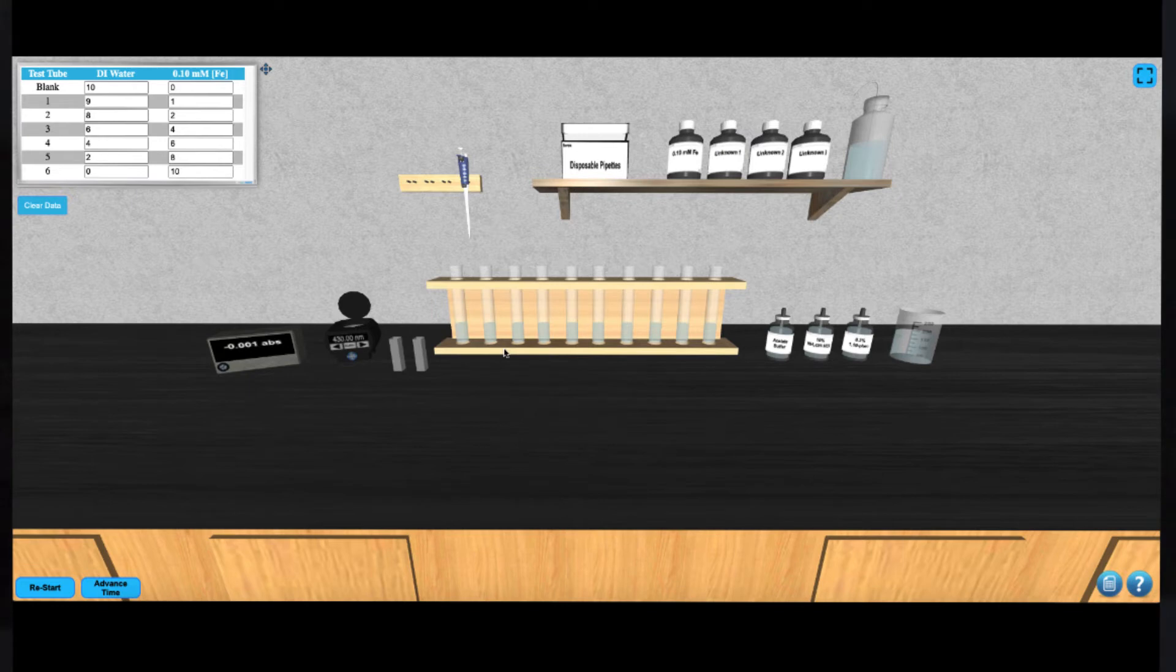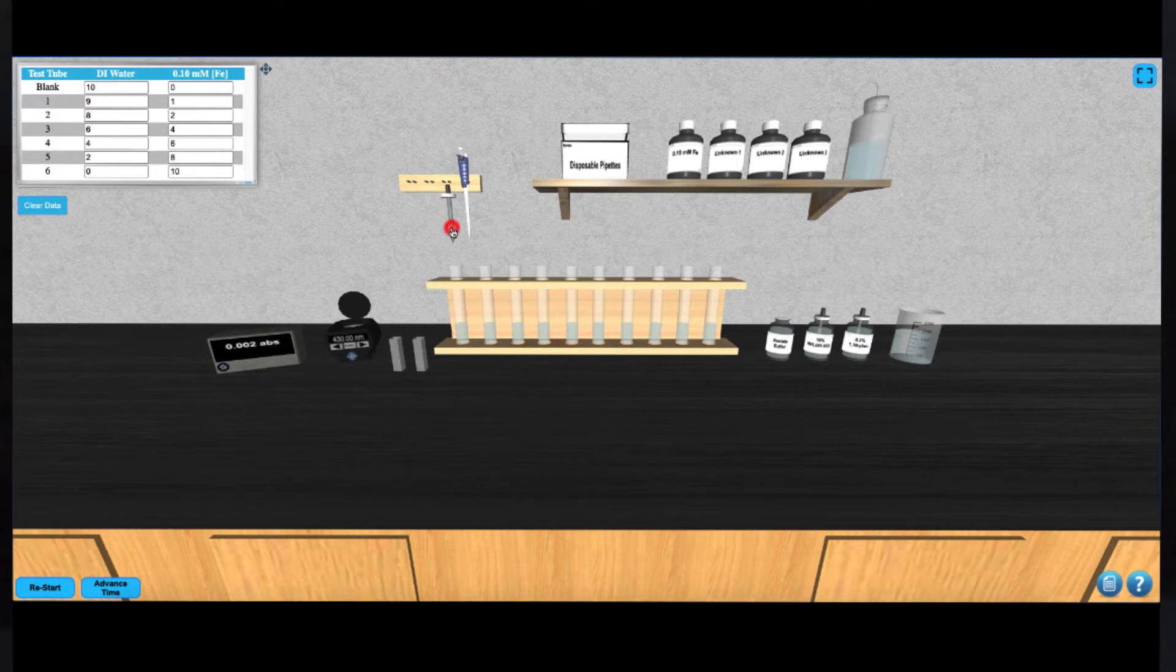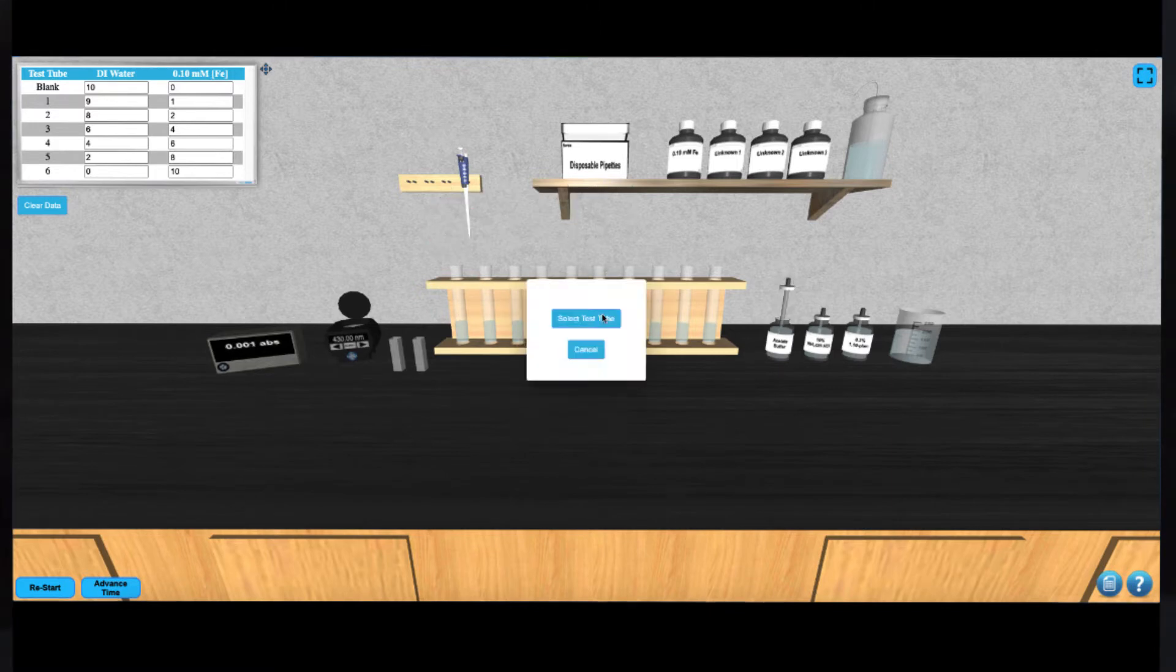Next, add 5 drops of acetate buffer to every tube. This can be done by clicking the acetate buffer bottle and then clicking the desired tube. Then click the dropper 5 times. The dropper will return to the bottle automatically.